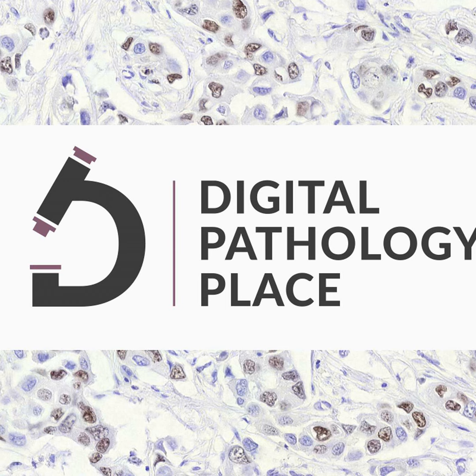But you don't want to rely strictly on the computer to make all of those decisions. It still requires a good deal of data to train the AI and the machine learning models. And it also requires your expertise as the person that designed the panel for which biomarkers you do want to see and you do want to go after, because the AI is only going to be as good as the image that we present it.